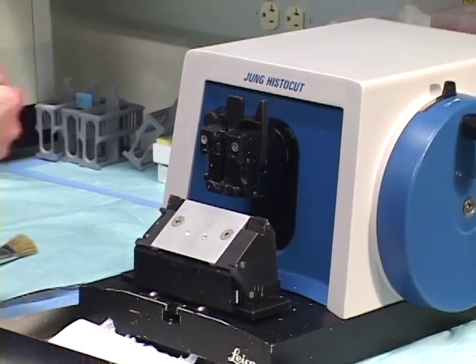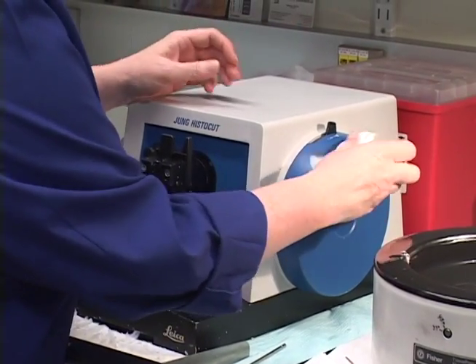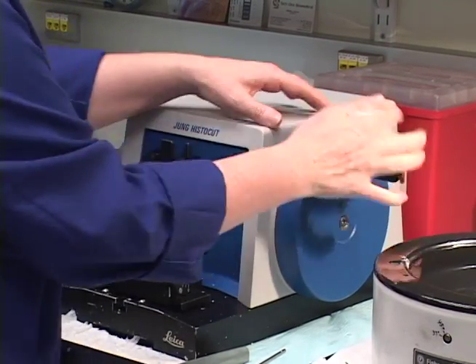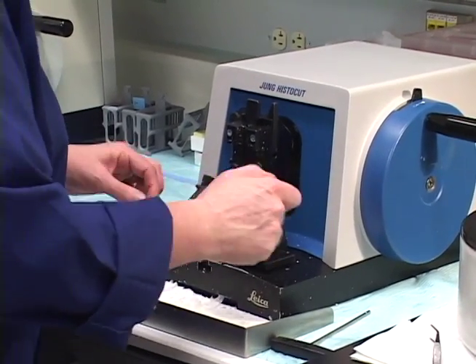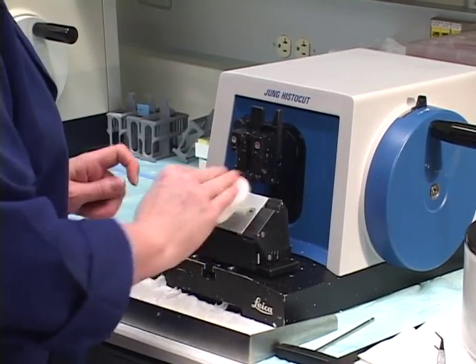Also, these handles get really thick with paraffin when you're microtoming and it feels kind of icky. So wipe those off for the next person so they don't have to feel that. Wipe the plate here, and behind the knife blade holder.